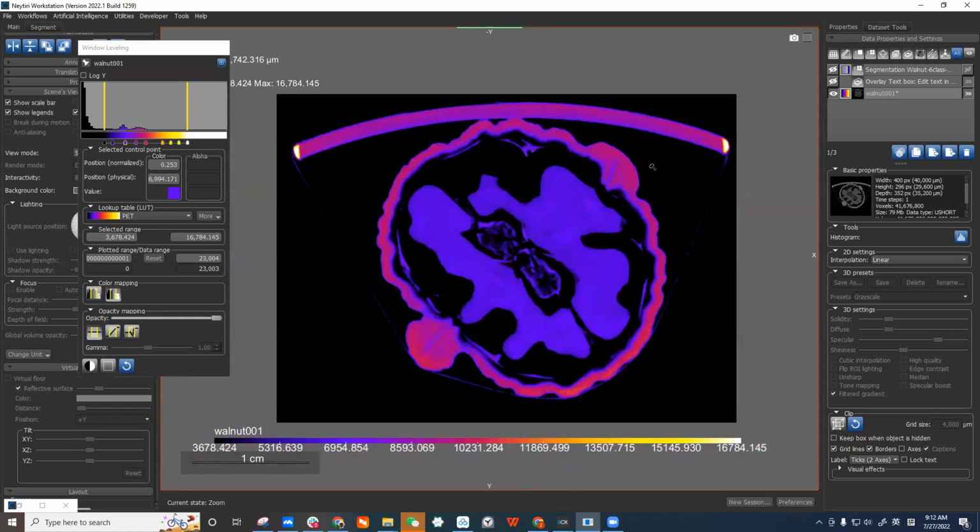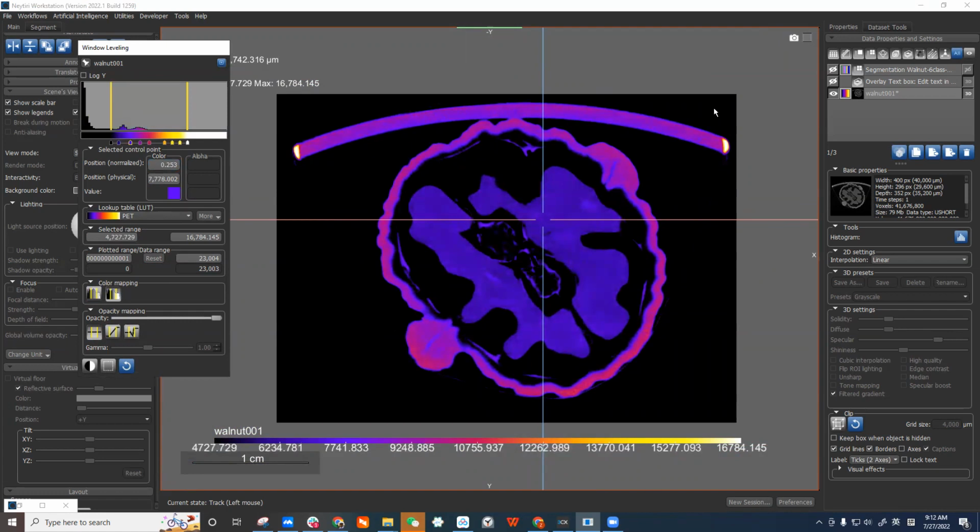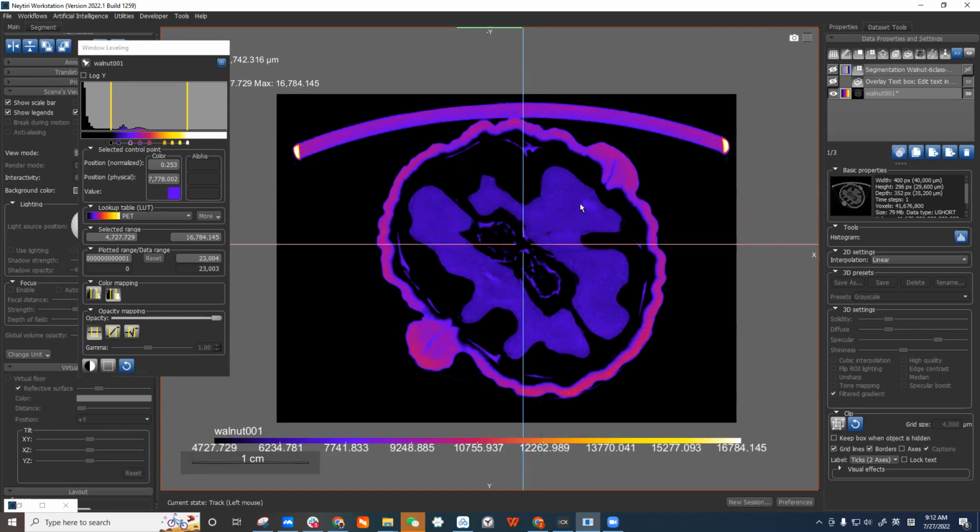Okay, now let's answer one question: why is the background black? Because every pixel in the image has an intensity, even outside of the specimen. When we do a CT scan, normally the field of view is a cylinder. Every pixel outside the cylinder is not even air, it's just blank. But we're not able to save blank, like not a number, in the image file, in the grid. So we give everything outside a zero intensity. That's why we have a lot of zero intensities here.